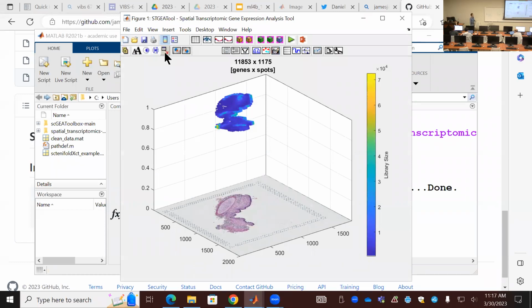So on this picture, you have this tissue slide image, and that's your profile for the probes you sampled, all the spots in there. There are 1,175 spots, but we can treat those spots as individual cells, although they are a mixture of maybe 5 to 10 cells under each spot.